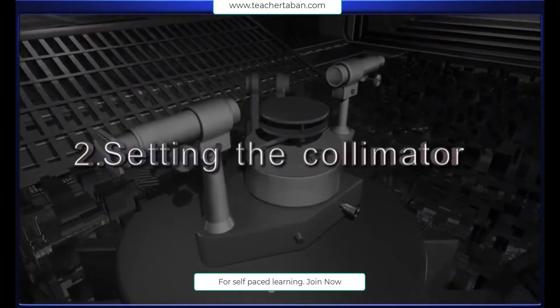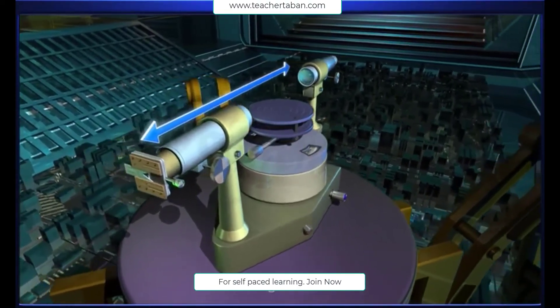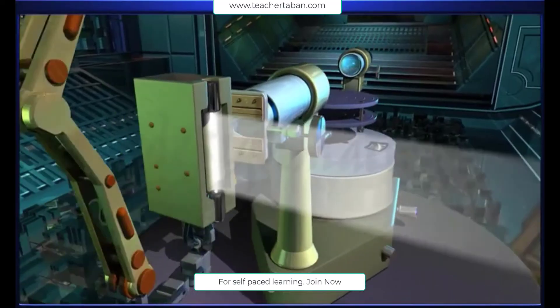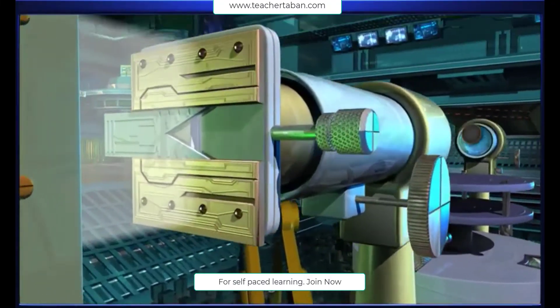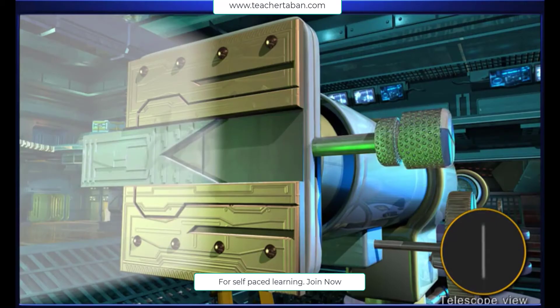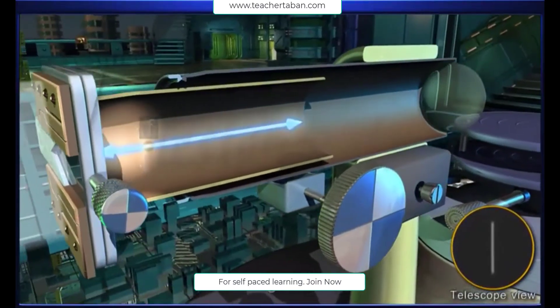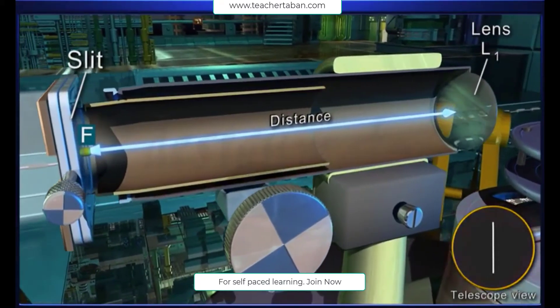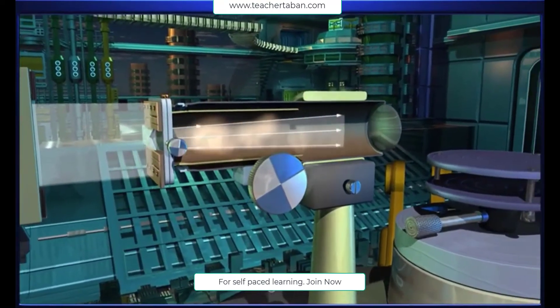Setting the collimator: the telescope is turned so as to bring it in line with the collimator. The slit of the collimator is now illuminated using a source of white light. The height and the width of the slit are adjusted to obtain a fine slit to minimize any error in measurement. In the collimator, the distance between the slit and the collimator lens L1 is adjusted so that a clear image of the slit is seen through the telescope. The collimator is thus ready to provide a parallel beam of light.